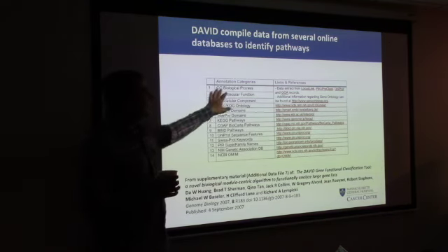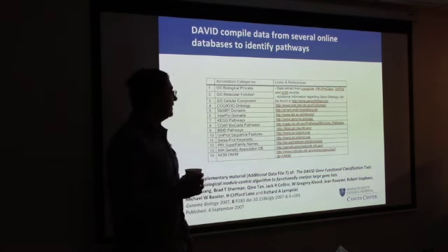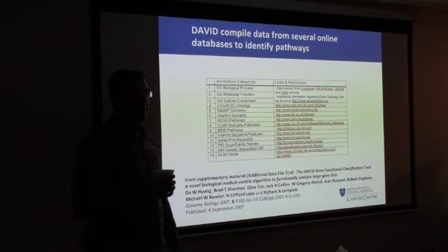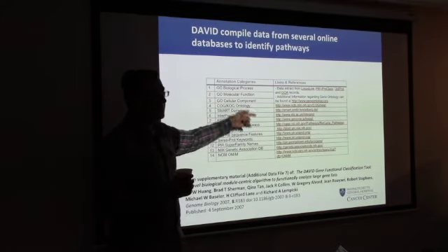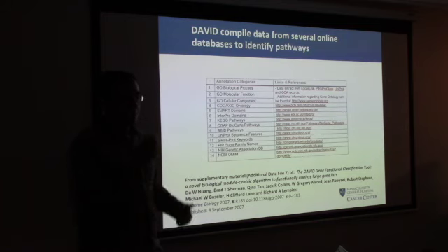So you have the GO biological processes, molecular function, cellular component, COG, ontology, and here are the links for each of those. So you can individually go and check out what those pathways represent, okay? And then it keeps updating from the back end, it keeps getting new gene sets from these, so you don't have to worry about that. The website always stays updated, okay?